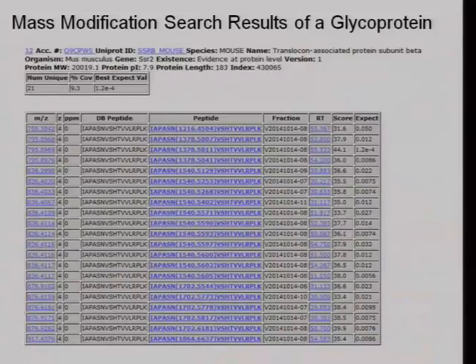A general approach to identify glycopeptides can be to do a CID fragmentation first to know what peptides have sugars, and then to do a second ETD fragmentation. Yes. So we like to have both the CID and the ETD data because they both give us useful information. For identifying the peptide, the ETD is most useful. But having identified the peptide, as you saw in what we went through today, you can identify all the different sugar compositions from the CID data.